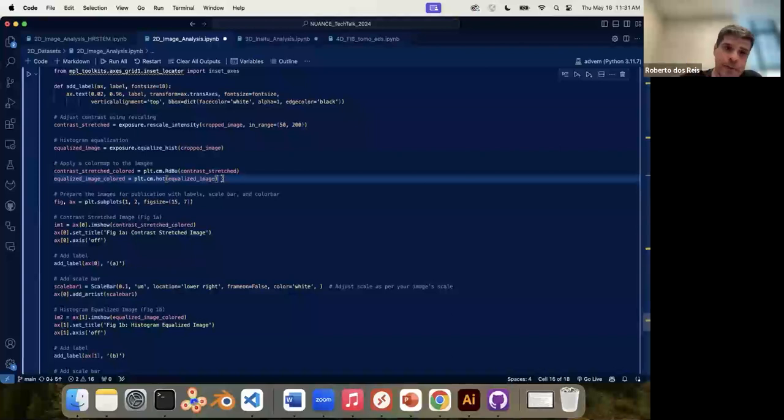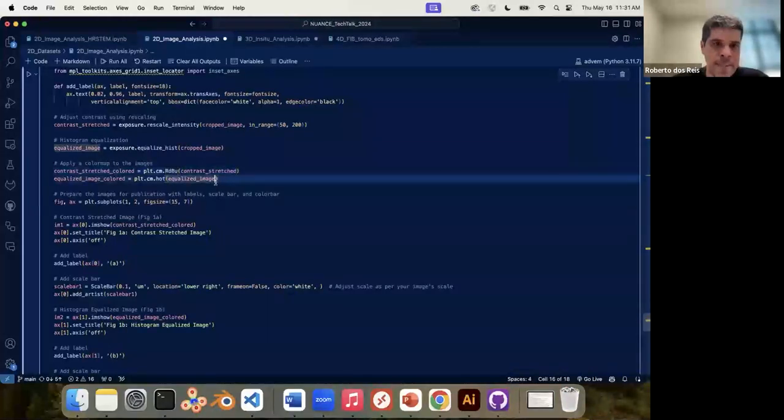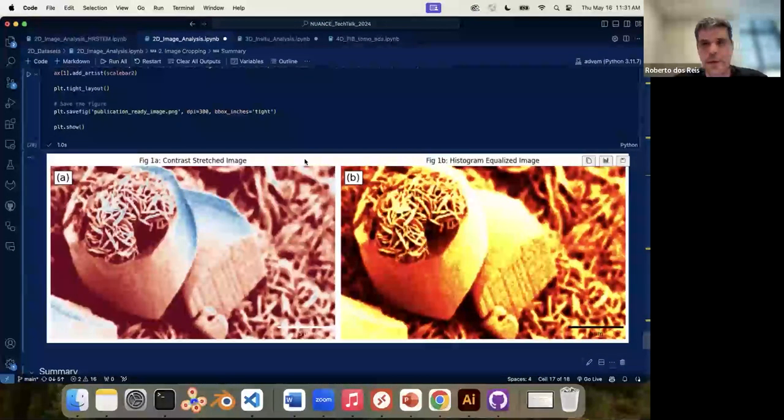Or simple color maps like just red or just blue or just green, right? So if you want to detach channels, for example, from an image, you can just separate in red, blue, green, RGB, right? So yeah, there you go. So you have a hot one here.